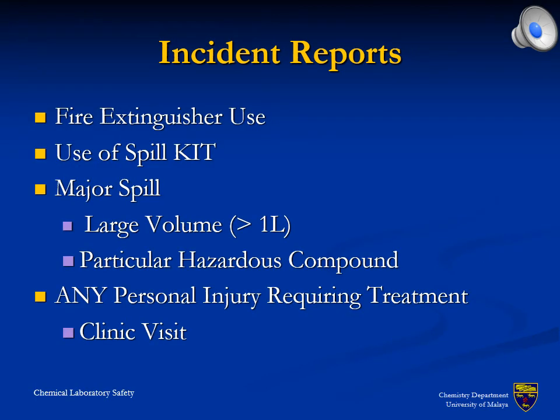Incident reports need to be filed. Accidents involving injuries, use of fire extinguishers and major spills need to be reported to the PTJ, while minor accidents only need to be reported to the responsible person for the laboratory and recorded in an internal book.